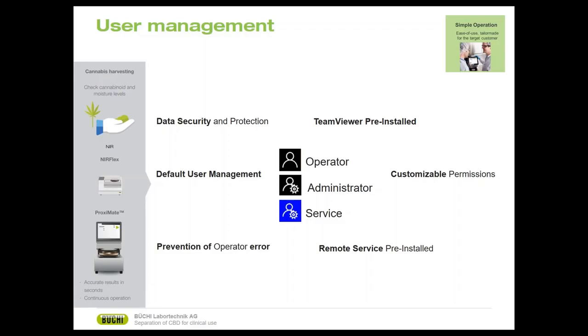That means once you select the operator, that operator cannot interfere with your calibration. It means your operator can only do measurement. Once you select the administrator level, you can play with your calibration, you can change calibration, you can add calibration, and you can do anything with the device. So it is very important to make it level and level.